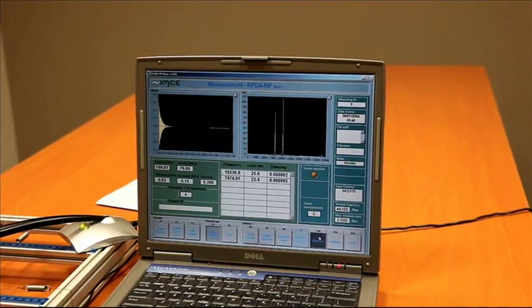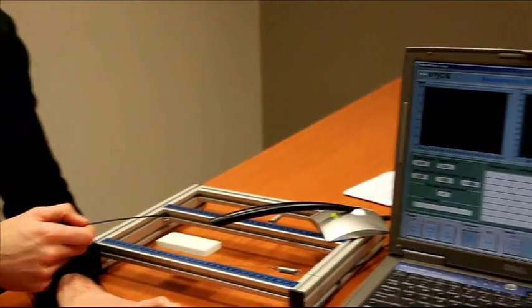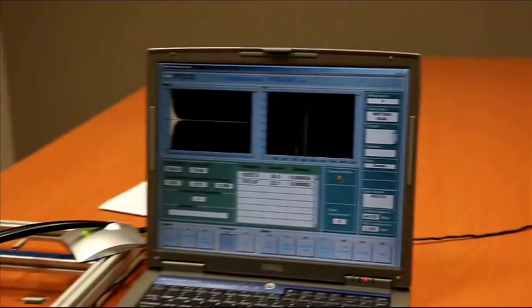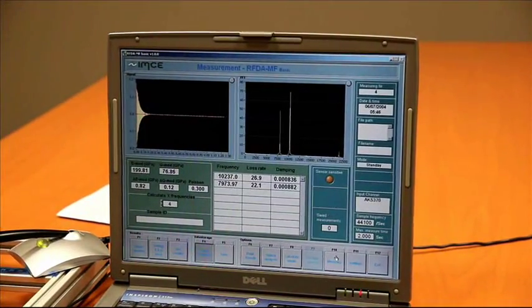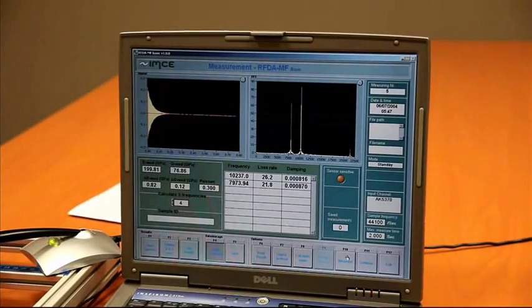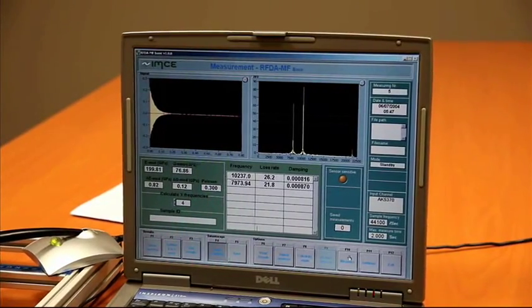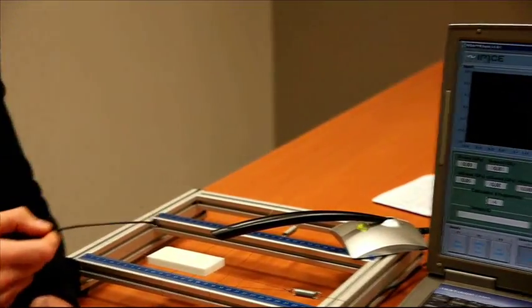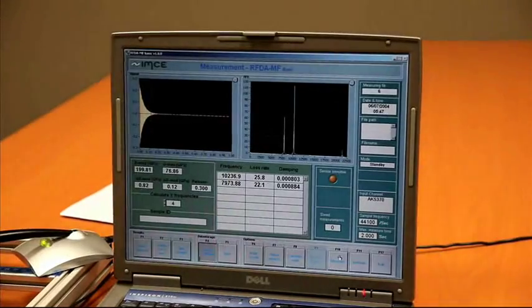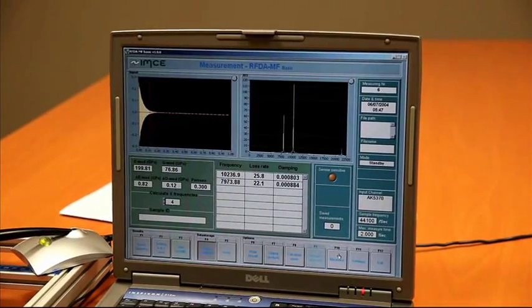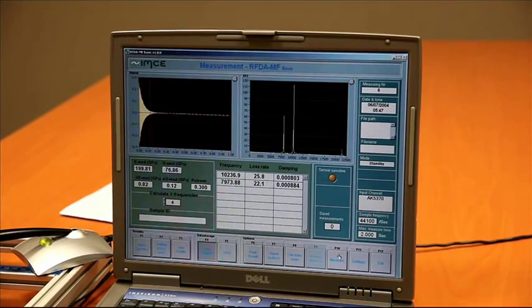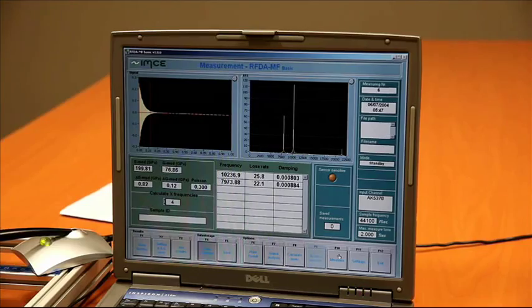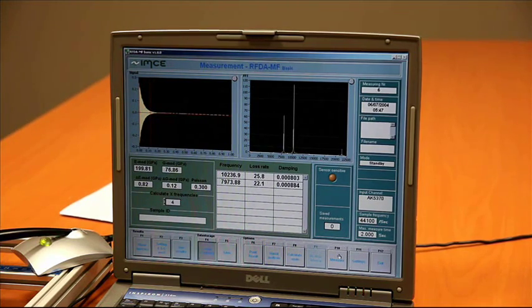Let's do some other measurements. Again, we have about the same results. Again, let's do that one more last time. Again, we see about the same results. We have very good reproducibility for the elastic properties using this setup.